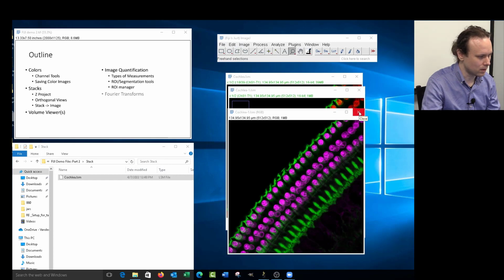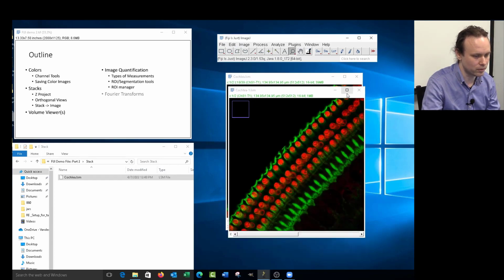All right, I think that is it for colors from last week. Are there any questions about colors? Please feel free to type in the chat or unmute yourself and ask a question if you'd like. Well, if there are no questions, we'll just move on to stacks.